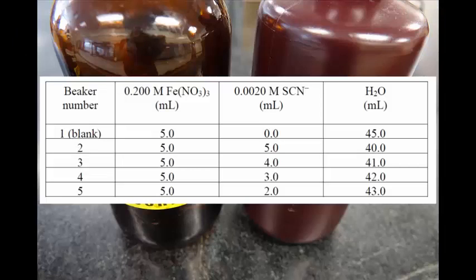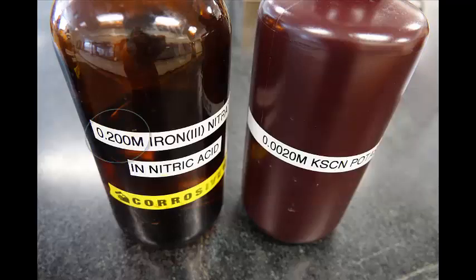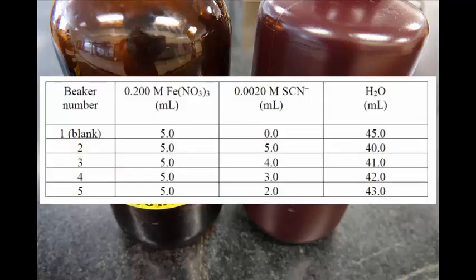For part 1, you will prepare 5 beakers with varying amounts of iron nitrate and thiocyanate. In part 1, it is important that you use the 0.200 molar iron nitrate. Since it is much more concentrated than the thiocyanate, we will assume that all of the thiocyanate will react, hence the reaction going to completion. Use the table in your lab to be sure that you are preparing your beakers correctly, and note that each one should total 50 milliliters at the end.